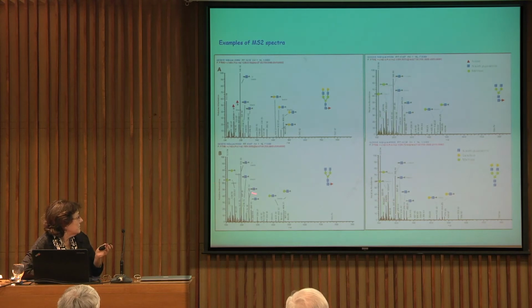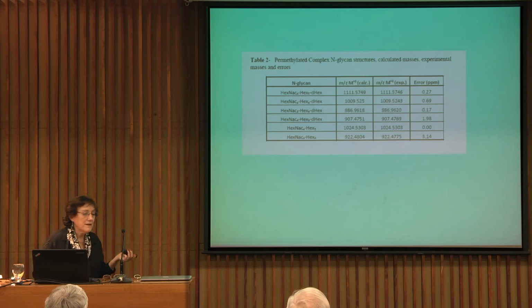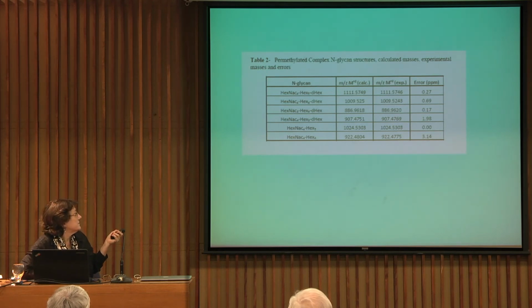The MS corresponded each to a little part of these structures. And so we could detect there were N-glycans, very small, and bearing the deoxyhexoses in Lactobacillus. Well, that was another approach, permethylated glycans analyzed by HPLC ESI mass spectrometry.